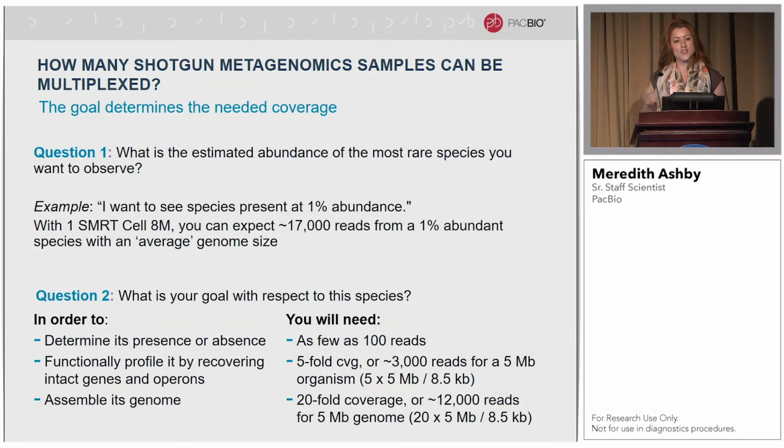So one of the big questions we always get is, can I multiplex? Can I multiplex on the Sequel II? And the answer is absolutely. And so how do you think about how deeply you can multiplex? So the goal of your experiment is going to determine how much coverage you need, and the coverage you need is obviously going to determine how highly you can multiplex.